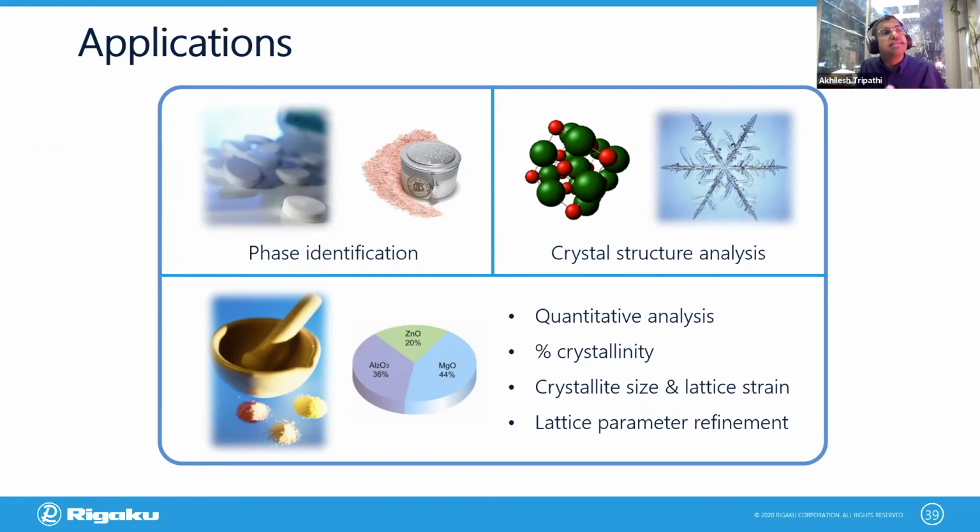Secondly, you can do crystal structure analysis. If you are modifying the material by some atomic substitution, you can tell how much atomic substitution was achieved, or which you were desiring. And quantitative analysis will tell you how much of each material is present. Now, quantitative analysis by XRD can go down to 1% if you are using a calibration type of approach, or it could have error up to 3% easily when you're using whole pattern fitting type of approaches. So just to make sure, we don't look here into parts per million type of accuracy, we look into some percentage, up to 1% by using calibration methods.